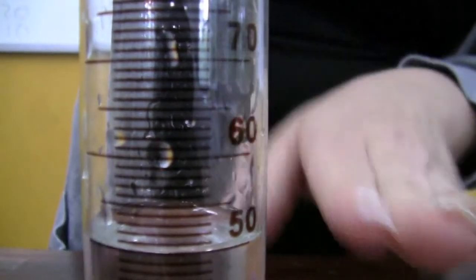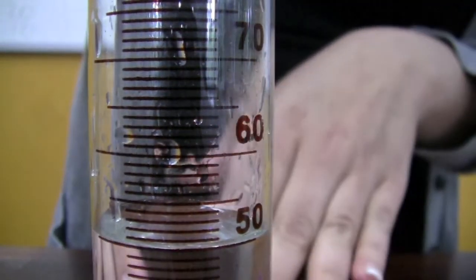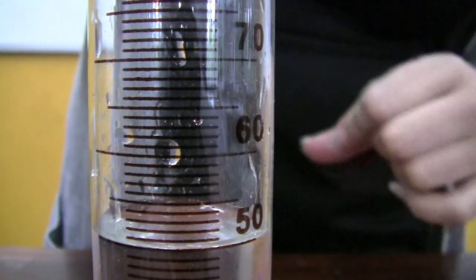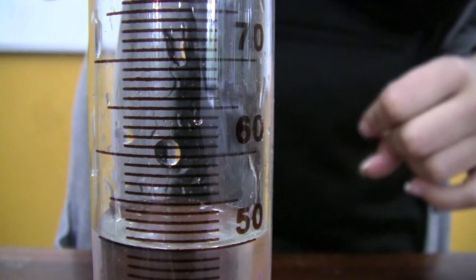So we can see that the meniscus, the dip at the bottom of the solution, is in line with the gradient. And that's how we measure our liquids correctly.